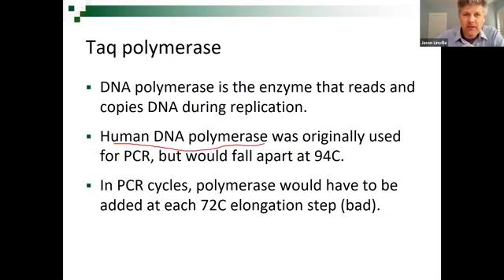So what do we know about PCR? We heat it up, the DNA comes apart. Okay, this is a little bit of review from spring break that everybody's forgotten. Heat it up to 94, the DNA denatures or comes apart. Cool it down to around 60 degrees, the primers attach. Then you heat it up to 72, the polymerase attaches and adds the dNTPs. We've covered the 4 different things in a PCR reaction.